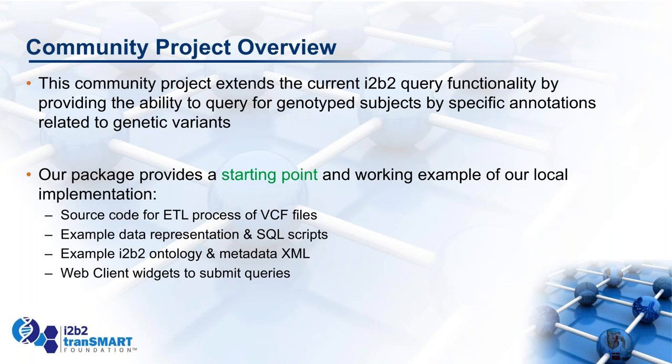So basically, just like Janice said, I'm one of the core developers on i2b2, mainly maintaining the web client right now. And I'm also involved with other i2b2 related portals at Partners. One of those portals is called the Biobank portal, and it's an internal Partners-only project right now. But it's essentially a web-based query tool that allows investigators at Partners to query and download data about consented biobank subjects here at Partners. So they can use the i2b2 interface to make requests for plasma, serum, DNA, and also genomic data. We made genomic data now searchable in the biobank portal for 15,000 genotyped patients.